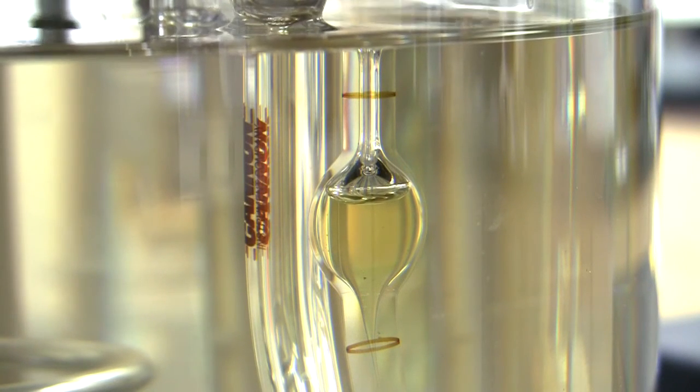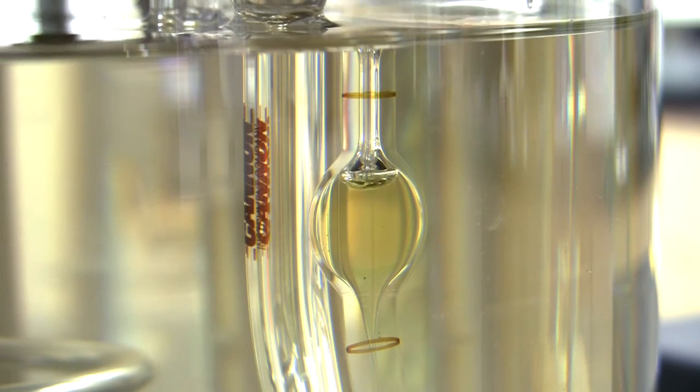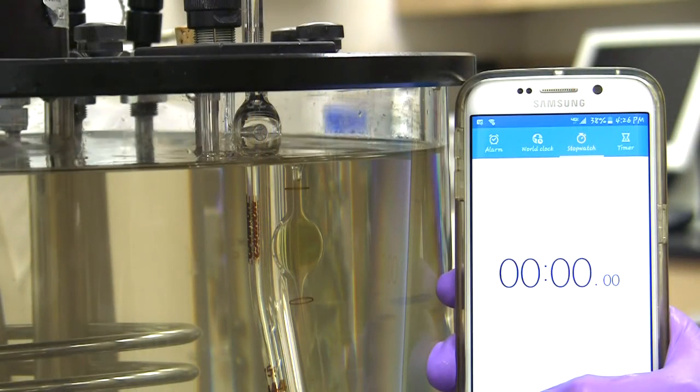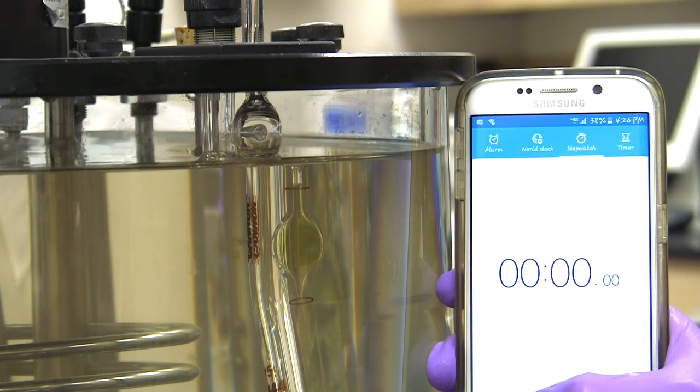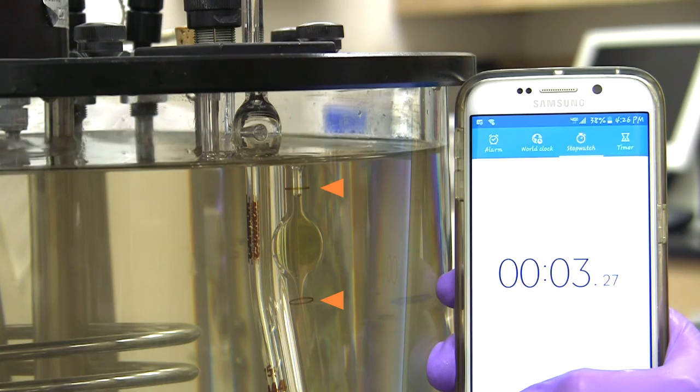Apply suction to the small tube or pressure to the large tube and draw the liquid slightly above the top mark. To measure the efflux time, allow the liquid sample to flow freely down past the second mark, measuring the time for the meniscus to pass between the marks.